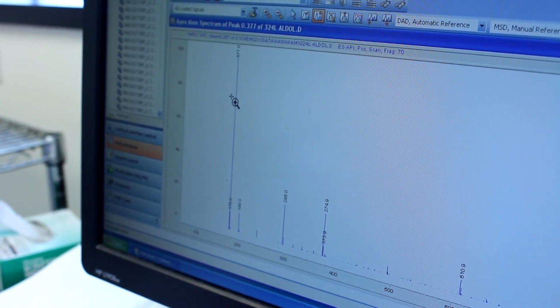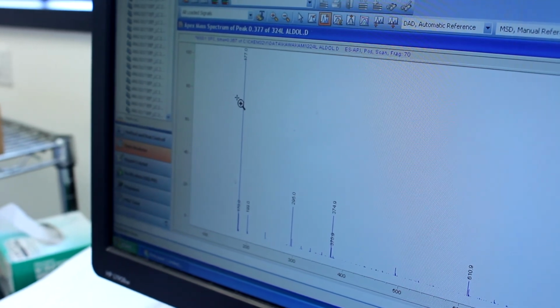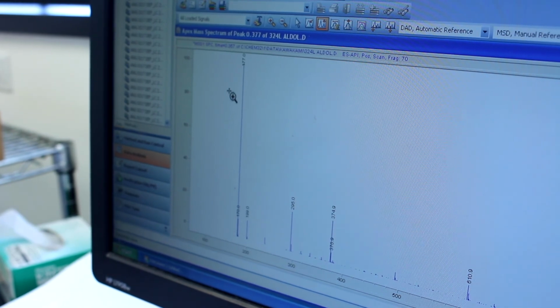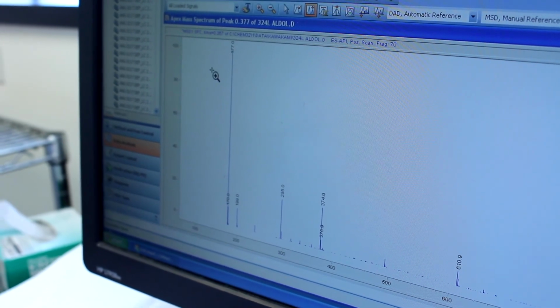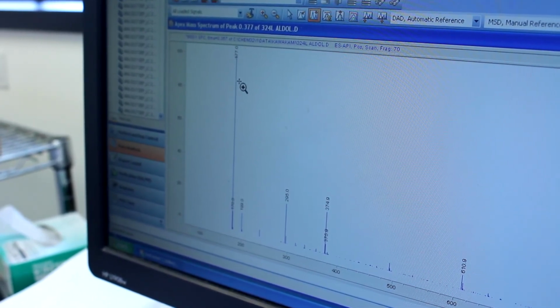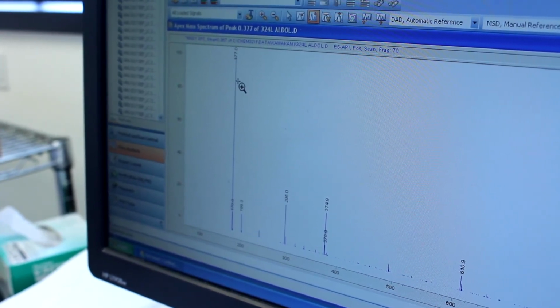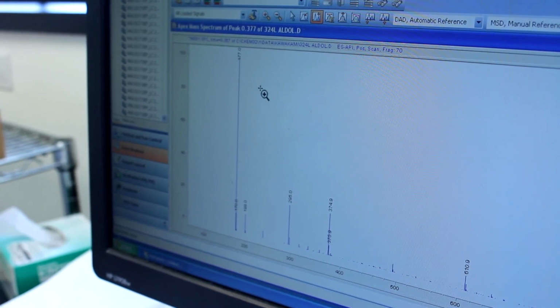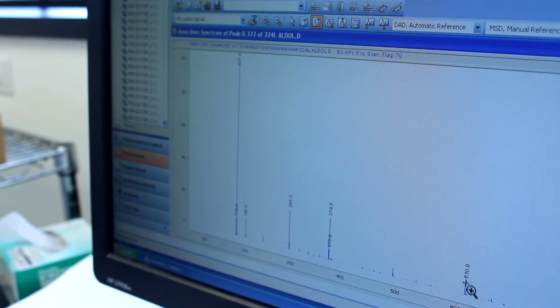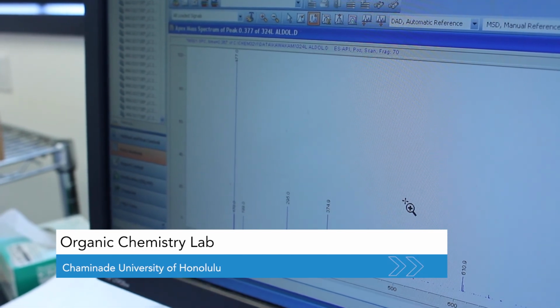So in other words, the acetone has reacted with one p-anisaldehyde on one side of the acetone, but it has not yet reacted on the other side. In other words, the reaction didn't go to completion, and this may be it. Maybe we didn't let the reaction run long enough. So if you let it run longer, in theory, you generate more of the product, and perhaps the product is what's really insoluble. And if it's really insoluble, then that will lead to better recrystallization. Instead, what dissolves is actually this impurity, it could be. And we're not sure about this 375 peak or this 610 peak. Alrighty, but in other words, we did make some of the product at least, so that's good.